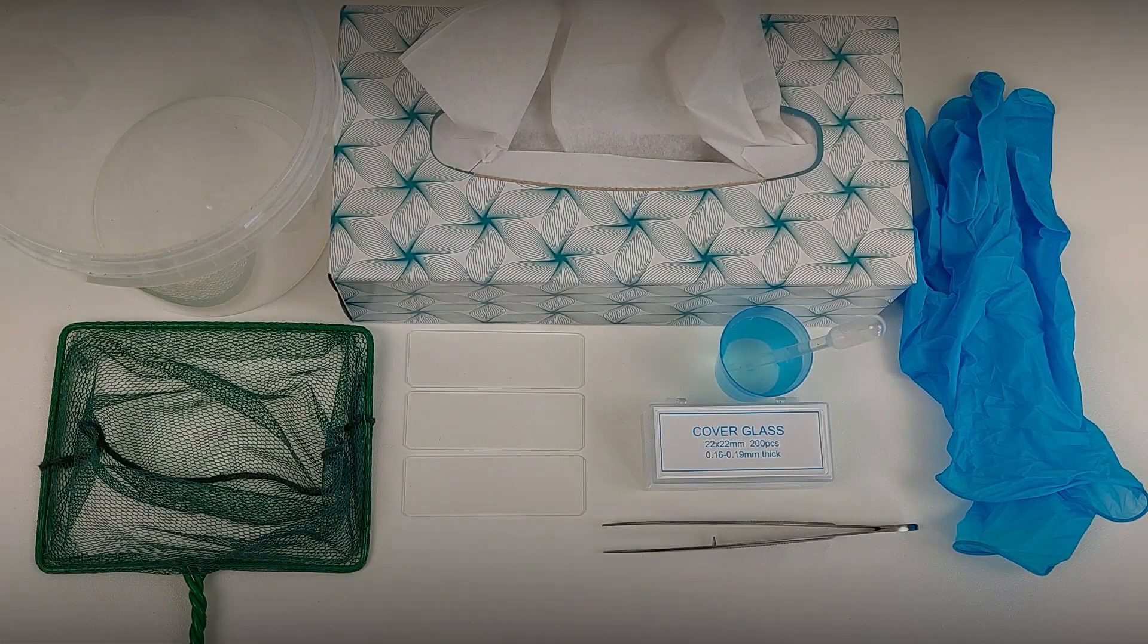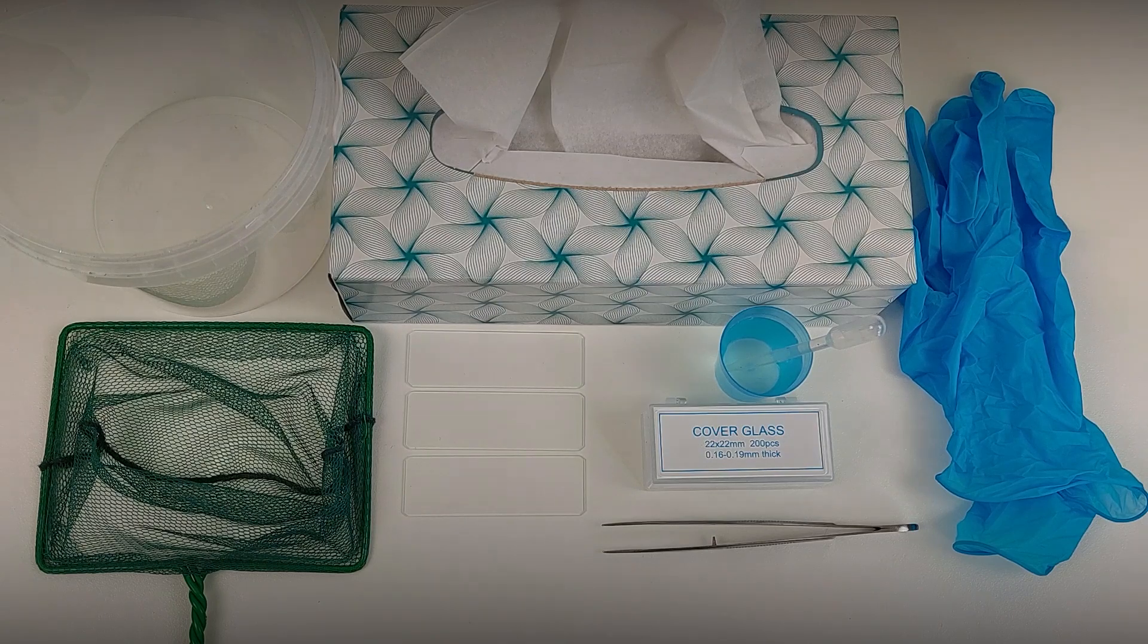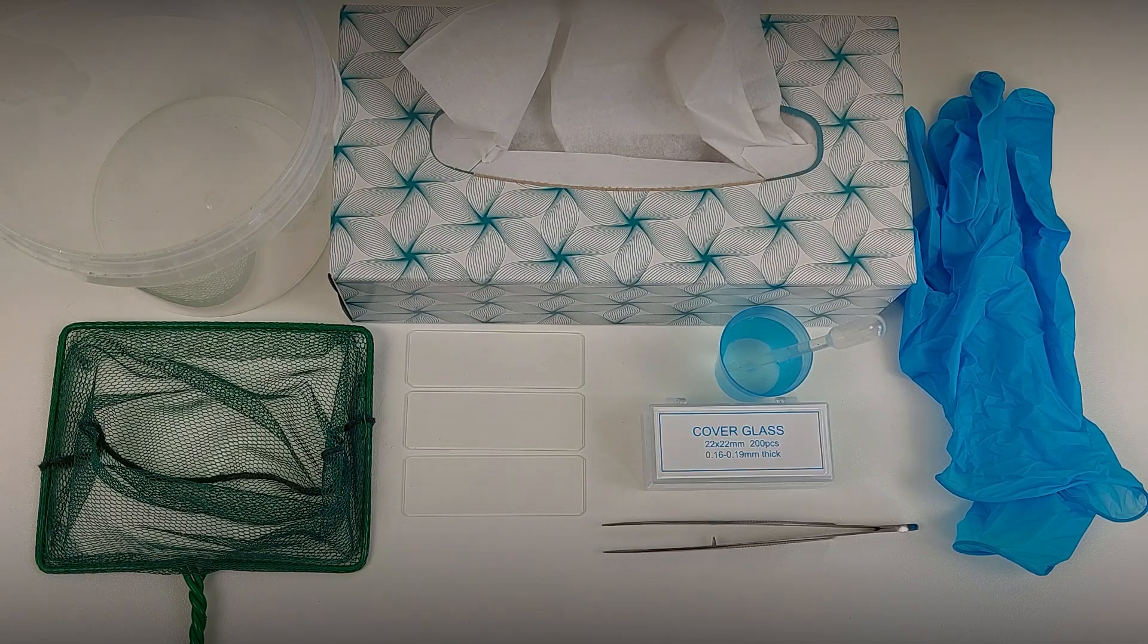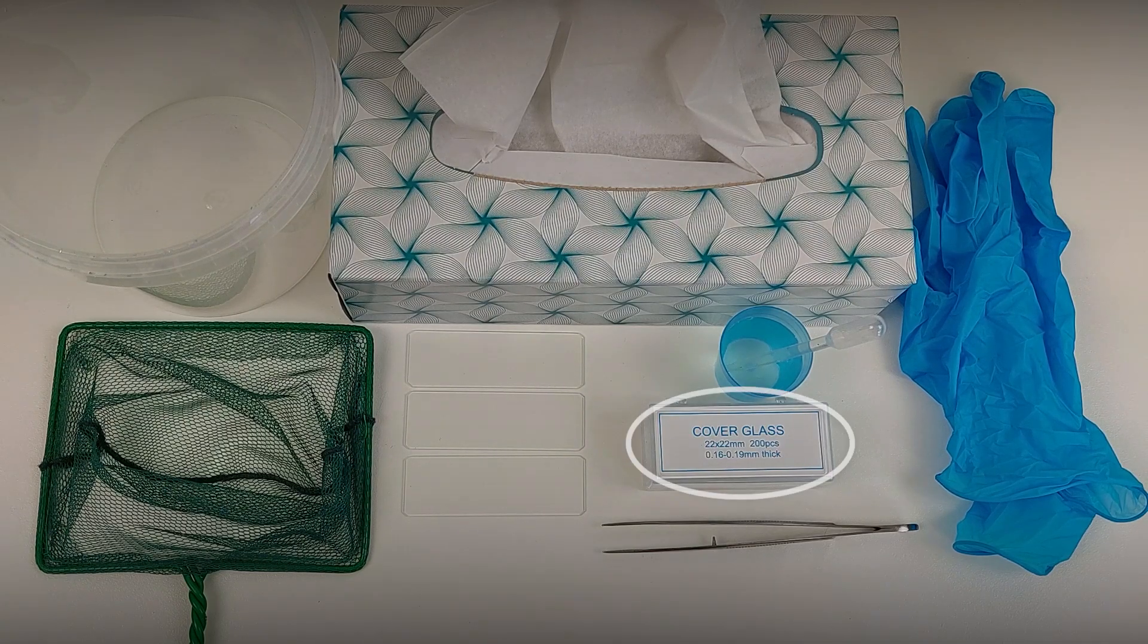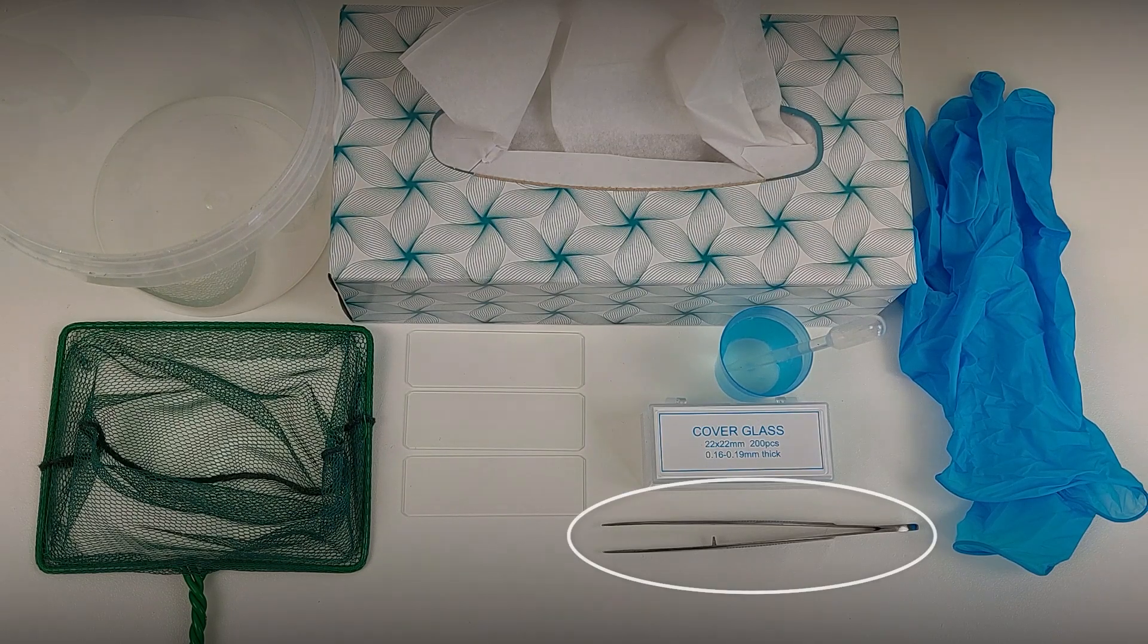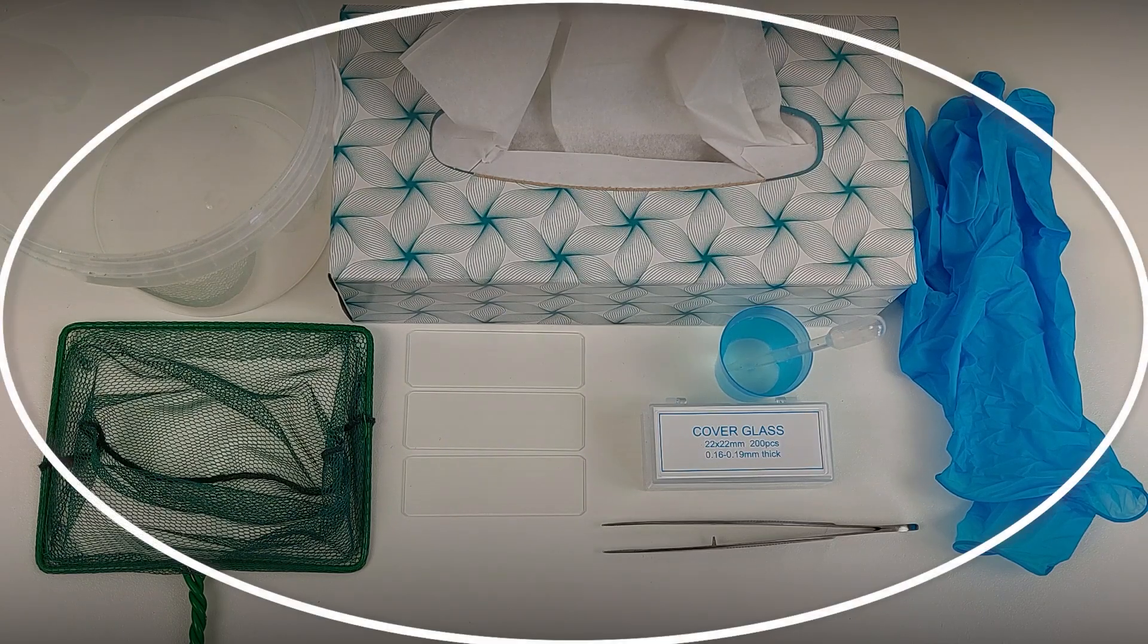To perform a skin scrape, we need the following tools and objects: a container with a lid to hold fish temporarily, a fish net, standard size microscope slides, a cover glass, a pipette or syringe, gloves, tweezers, paper tissue, and a well-lit workstation.